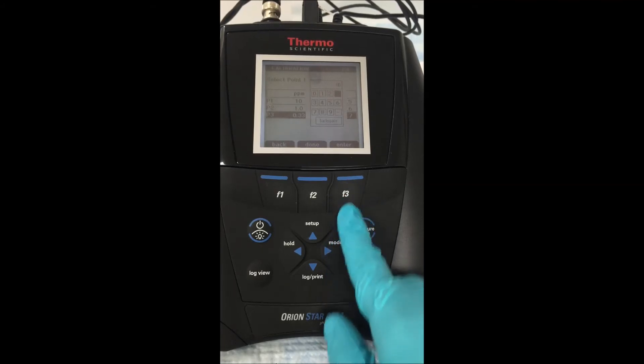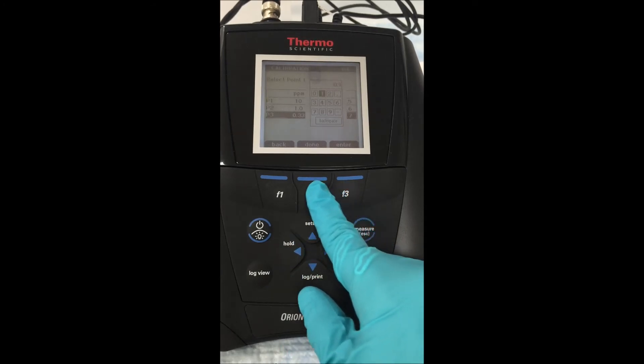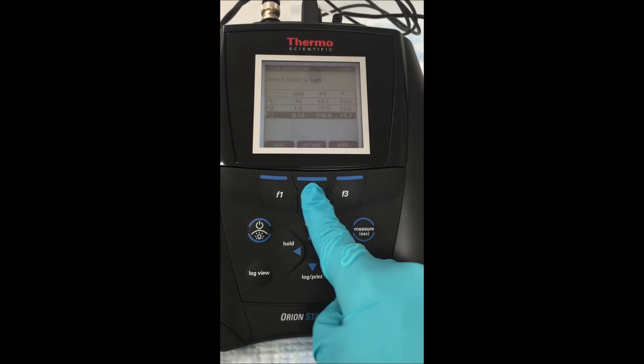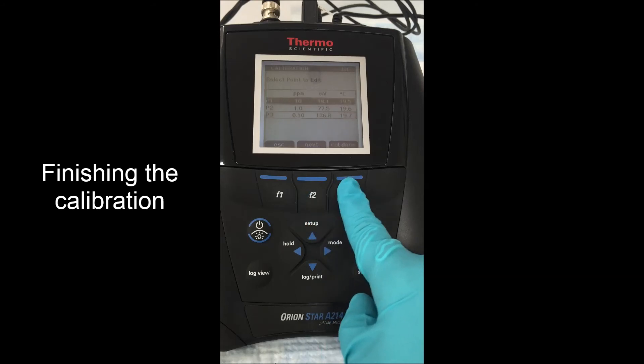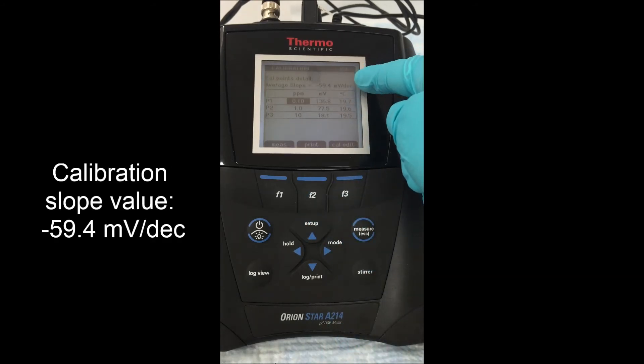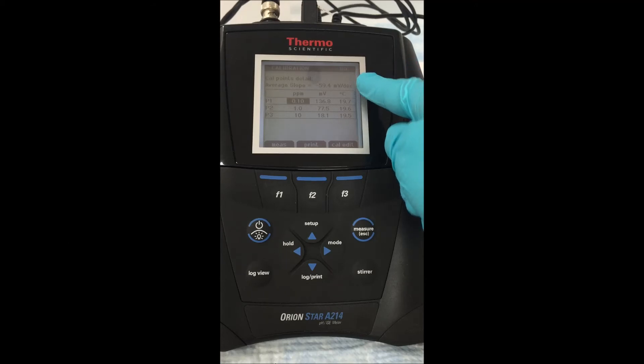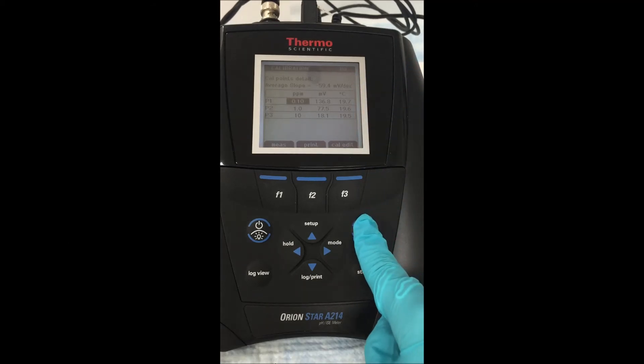Once we've input that final calibration point at 0.1 parts per million, we're going to finish our calibration. Hitting the button that says Cal Done, the meter is then going to display the slope value. This slope should be between 54 and 60, and 59.4 is an accurate slope value.